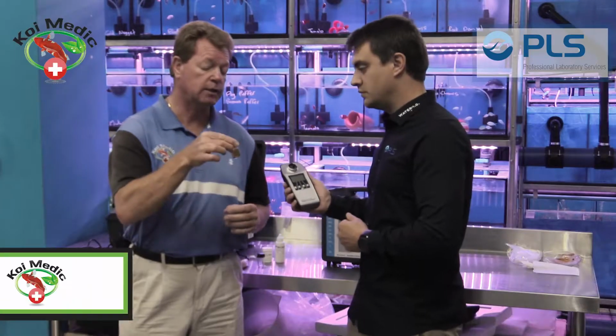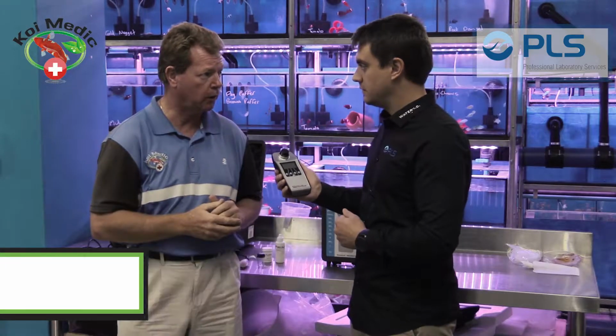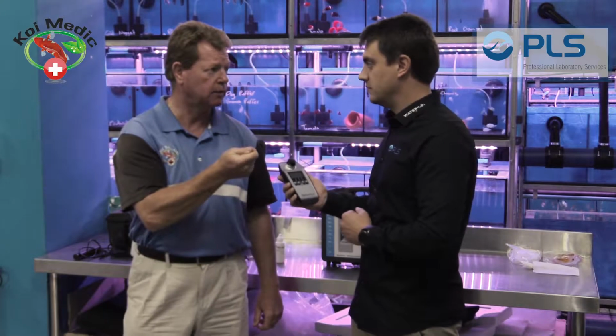So Jaco, what you're saying is that if we're testing for, let's say, pH, I will put the sample in there, and then the photometer will read. That's correct. The photometer reads what color is absorbed in your sample, and according to how much of the color is absorbed, that gives you a reading on the parameter that you are testing. Like you say, pH, it will give you a pH reading on your water sample. And it'll store it in memory, and I'll be able to send a report to my client on his mobile device.